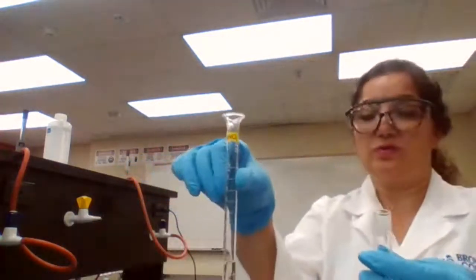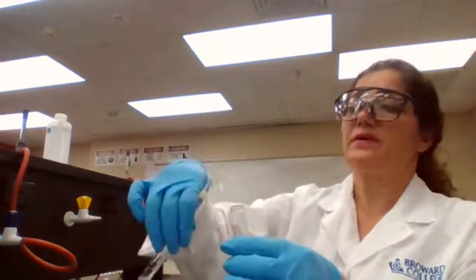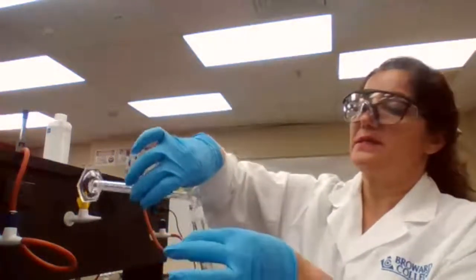I'm going to add 2 milliliters. Let me measure it exactly. Makes you feel better. Using a graduated cylinder, I measure 2 milliliters of the silver nitrate and I place it in the test tube.